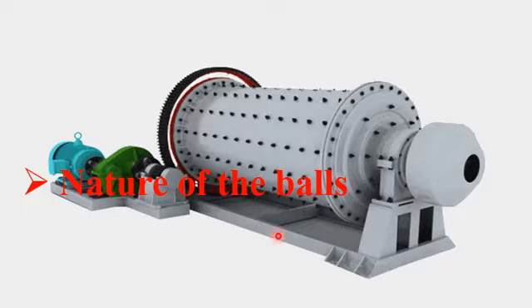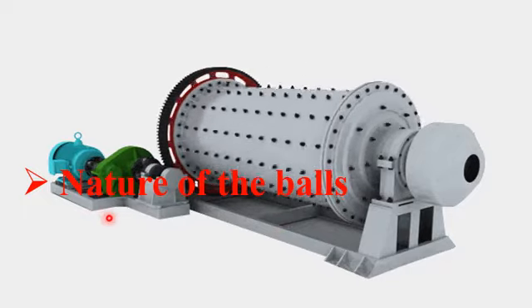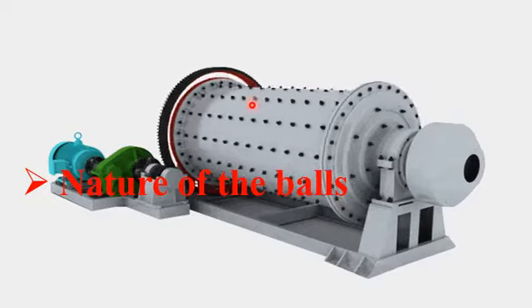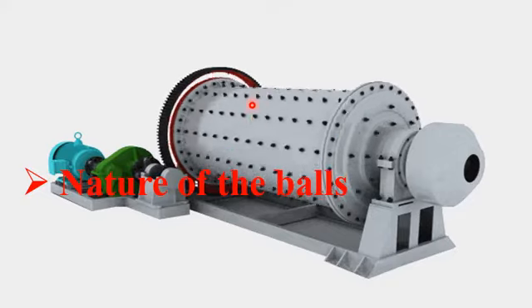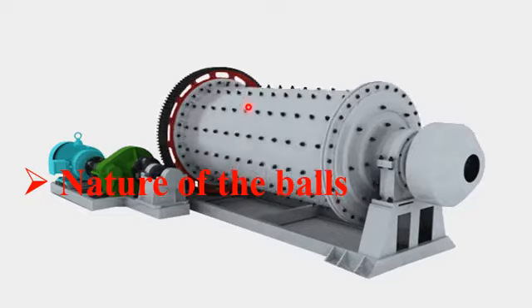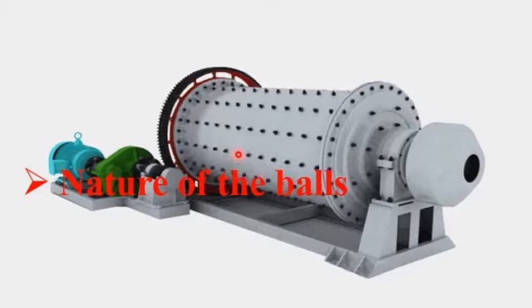Okay, inside this drum. So when the bulk material is incorporated inside the drum of the ball mill, we need to crush it. It is not easy if we have a hard material and we want to crush it with rubber balls.